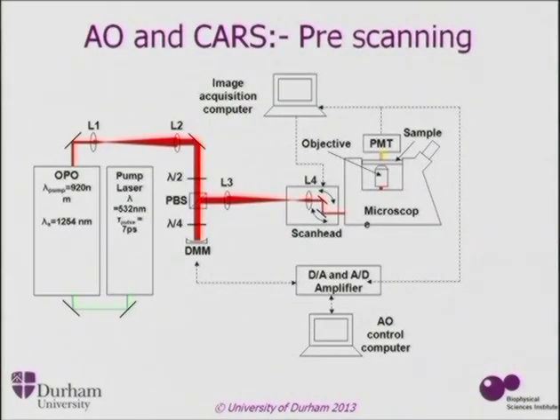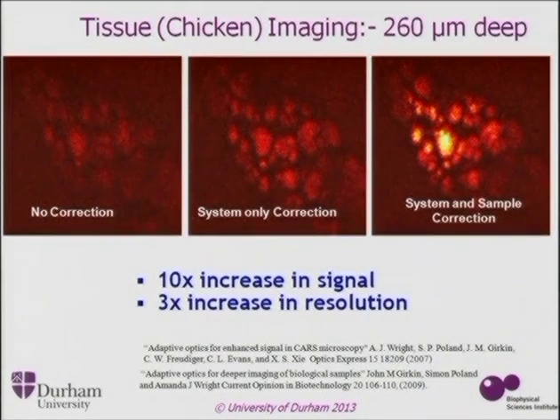As I said, we can do this in a CARS microscope. This is adaptive optics. We can either put the mirror here, or we can put it after the scanner. And this is the sort of image that you get. This is purely looking at, because it was what was available locally when we did this about 5 years ago now, in a CARS microscope. This was available from the local butchers just down the road from Sunny Zoo's lab.